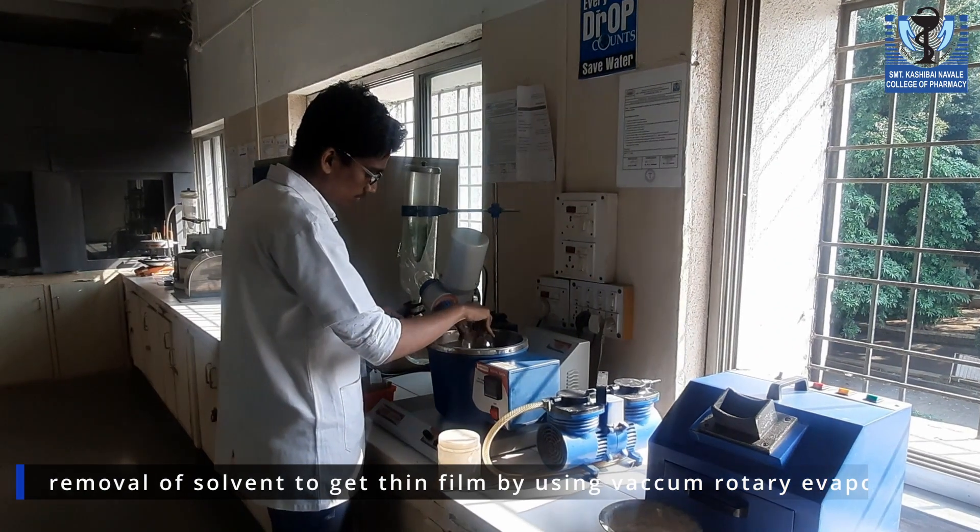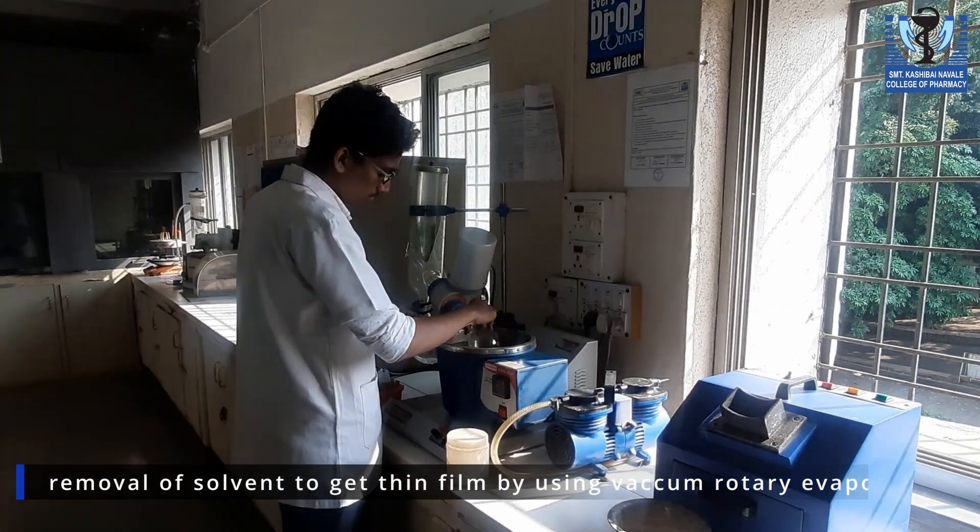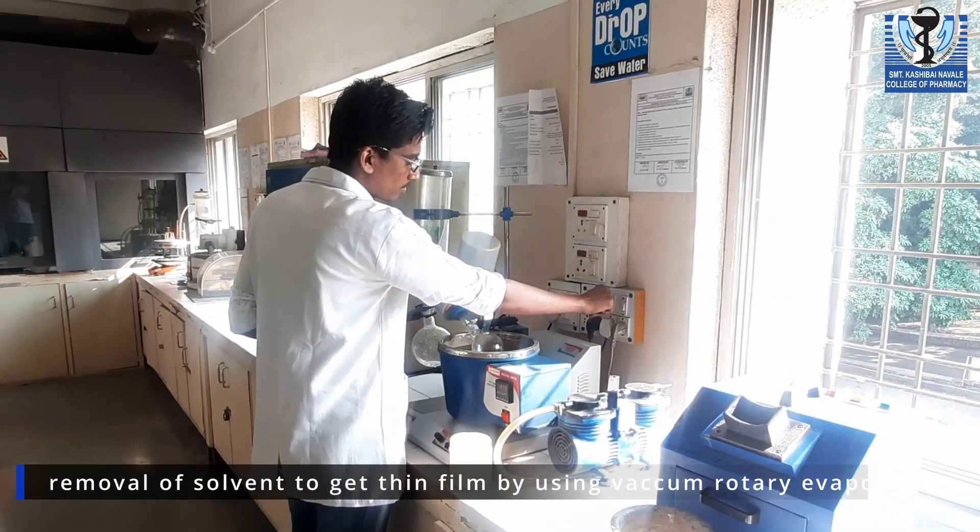Attach the RBF to a vacuum rotary evaporator to remove DCM and get a thin film of surfactant and cholesterol on the wall of the RBF.